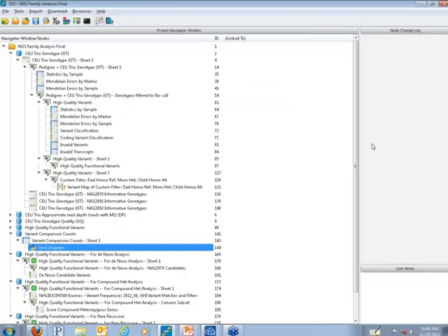What updates are coming in the future for DNA and RNA-Seq? That is to be decided. And again, we are soliciting feedback from our users as to where you would like to see us go in the future for DNA and RNA-Seq. So if you have any suggestions, please let us know. Some of the things that we have talked about are importing other analysis methods for collapsing methods for DNA-Seq, including SKAT-O or SKAT. For RNA-Seq, we've thought about other differential expression analysis methods, but again, we haven't decided on exactly where we're going in the future.